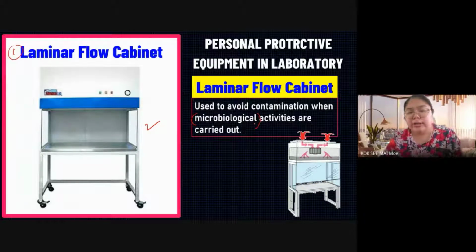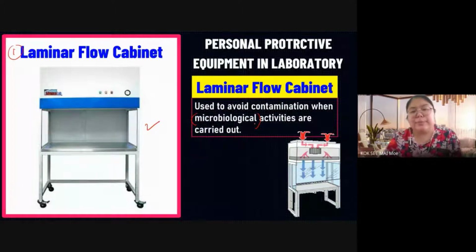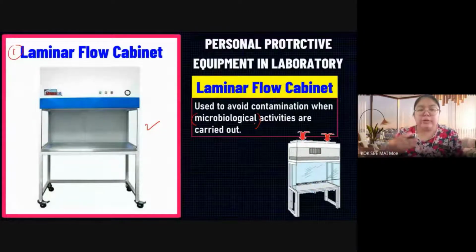So avoid the thing coming out. So all will happen inside only. The gas will be absorbed inside. All the things you do, the leftovers, the remains, we put them inside. Okay, don't put them outside. So this one we call laminar flow cabinet. So the air should flow inside only.